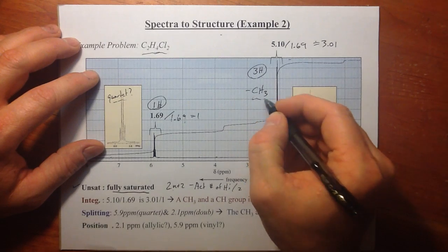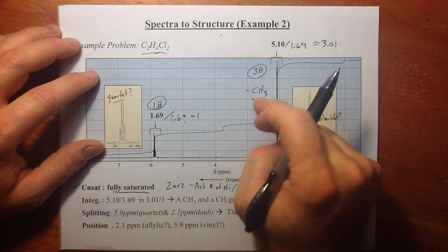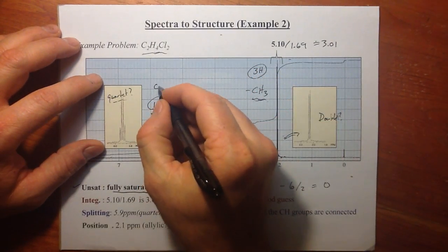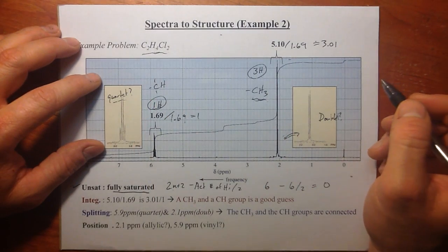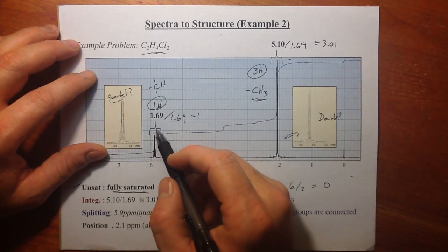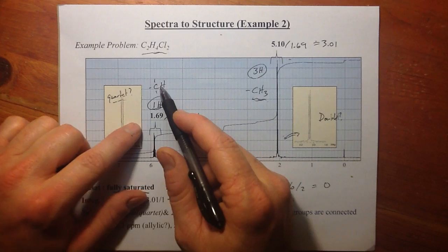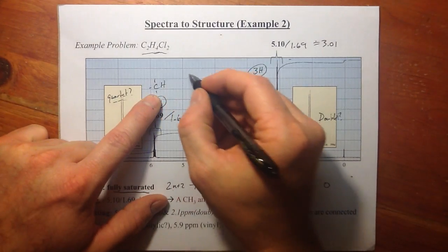We're going to put on our palette that this is our proposed fragment, in pencil, proposing this. And we can propose that we just have a CH group that has 3 other things bonded to it. That is represented here. We have just a single hydrogen off of a carbon because we only have 1 hydrogen here. Now let's put that together with the 2 chlorines.